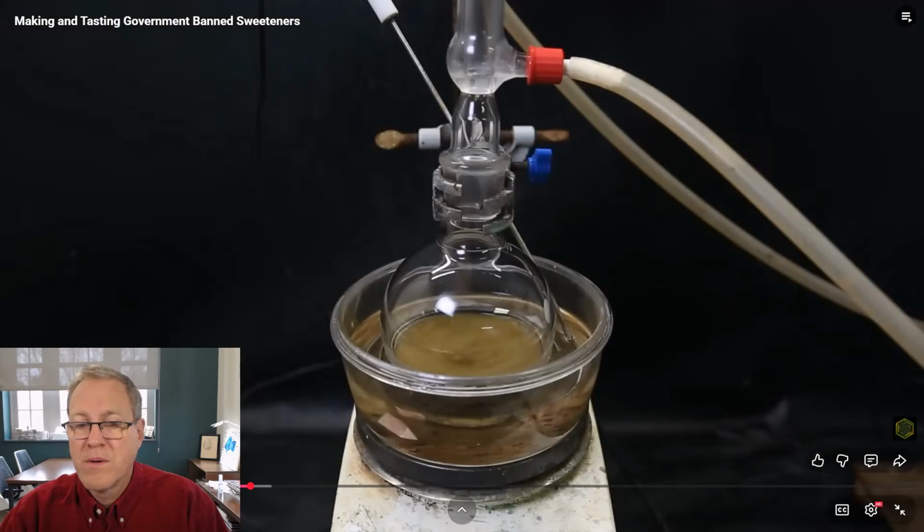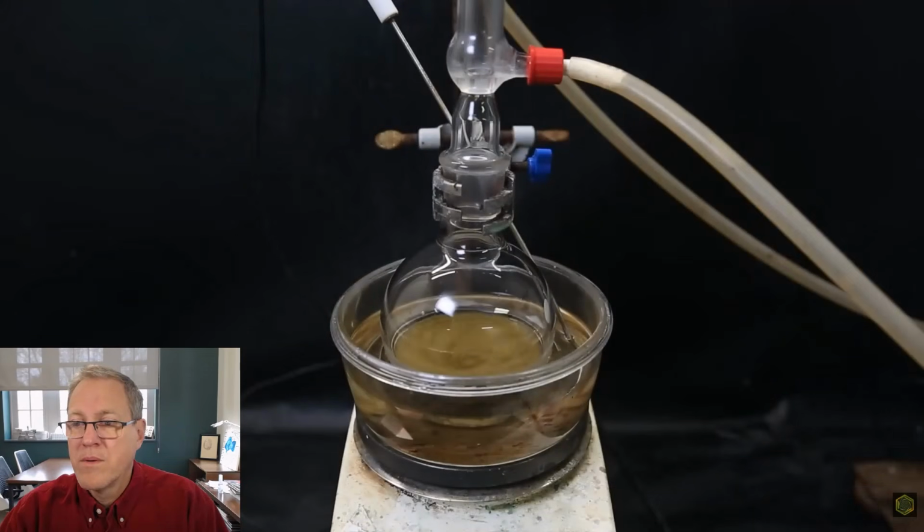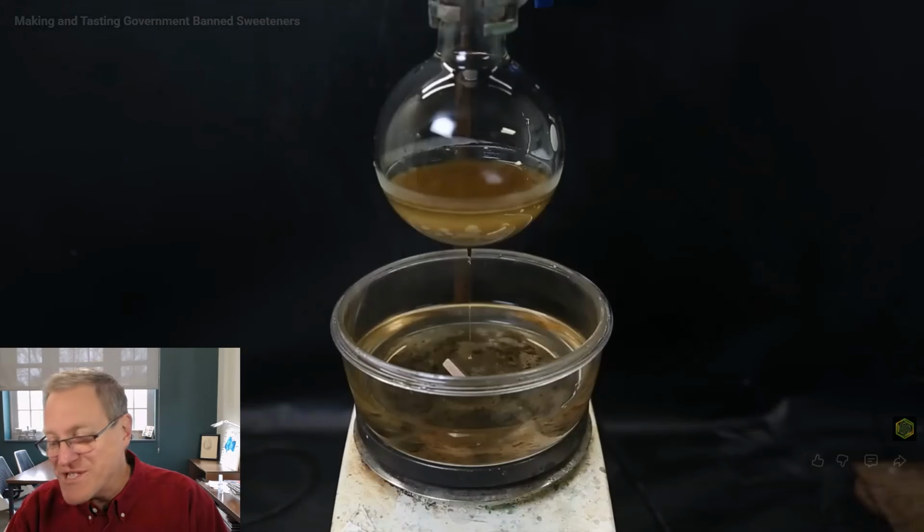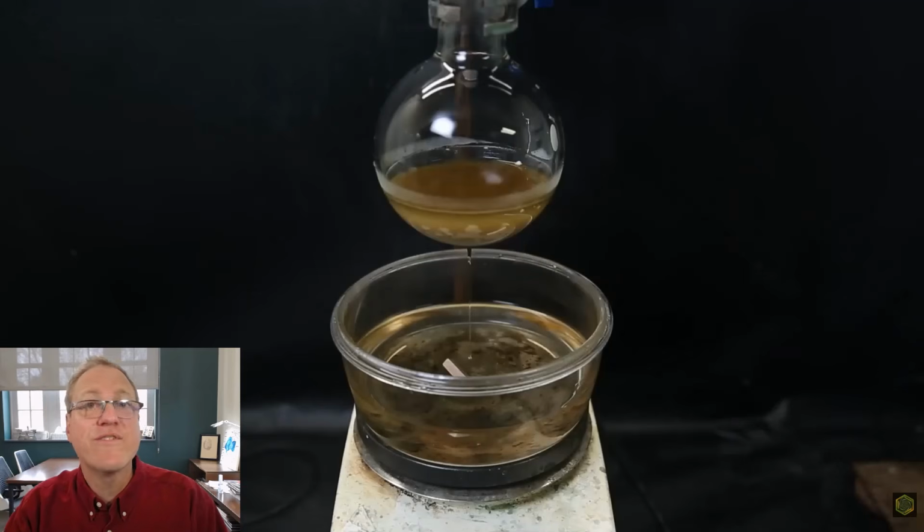When I come back after a few hours, a bunch of precipitated sodium bromide can be seen, and the reaction should be finished. Always good to see those solids form. Precipitates are a good sign something's happened, and of course, we want something to happen.